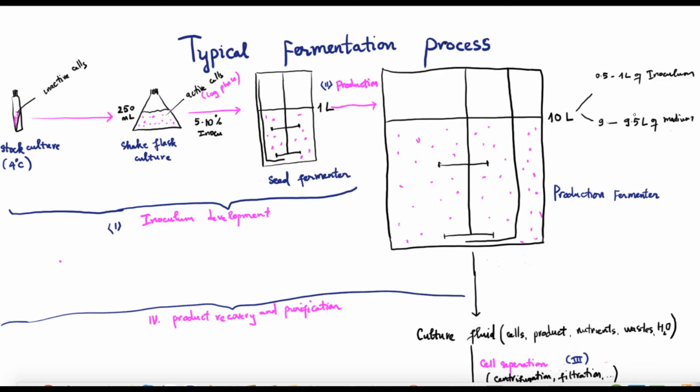Here's something that we need to pay attention to. In case we need a large volume of inoculum culture, we have to gradually scale up the inoculum culture.